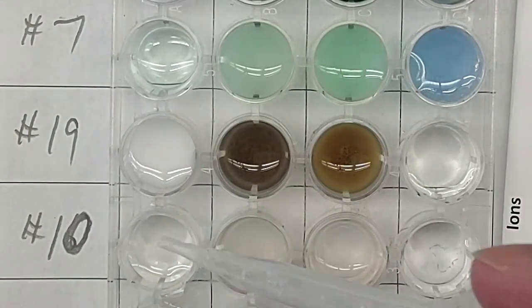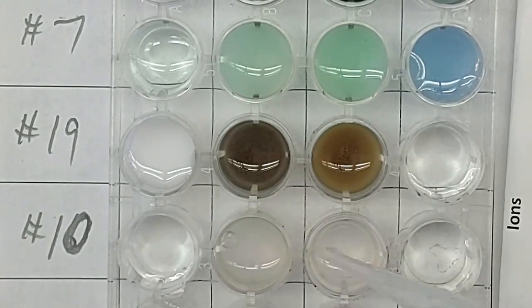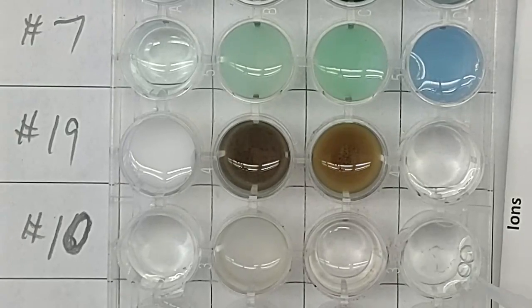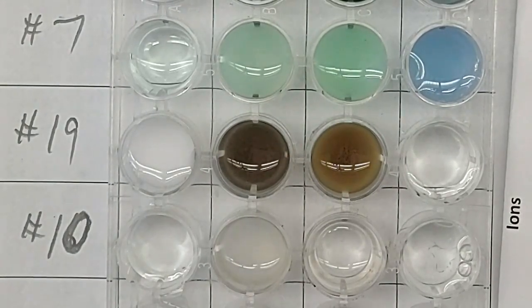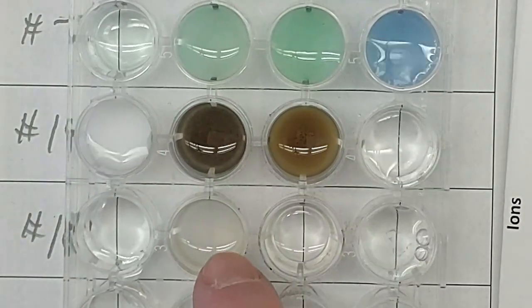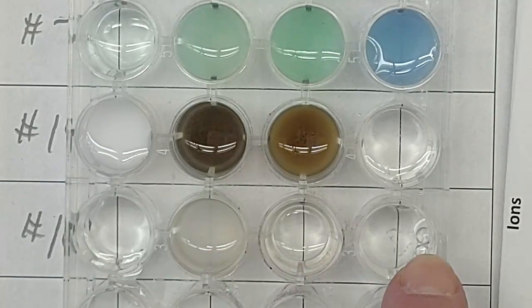Stir them up. Clear, colorless. Looks a little cloudy, whatever color you want to call it. Clear, colorless, clear, colorless.